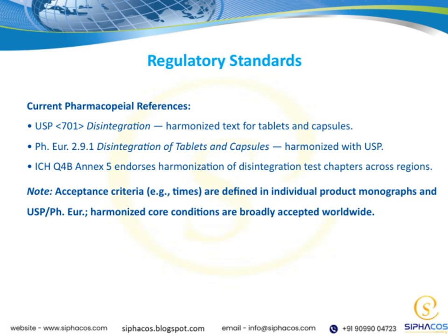It's important to note that while these standards set the general guidelines, the specific acceptance criteria, like the disintegration times, are usually defined in individual product monographs and in the USP or Ph. Eur. texts. Overall, there's a broad consensus worldwide on the core conditions for disintegration testing, which helps streamline regulatory processes and ensures quality across different markets. This harmonization is a key step toward consistent, reliable pharmaceutical testing globally.